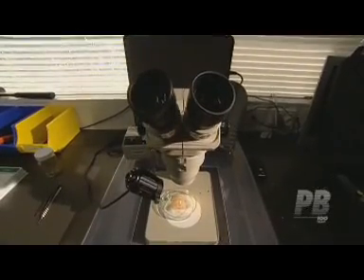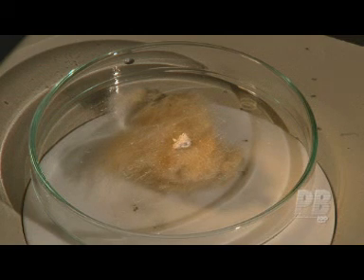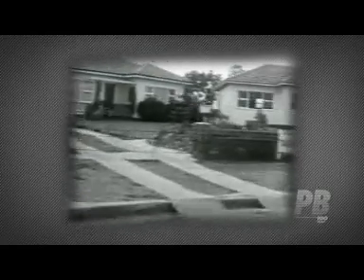Results reported as hand-picked refer to the asbestos distributed unevenly in a large body of non-asbestos material. This may be due to the sample being contaminated or residual asbestos material being left behind following a poor removal job.